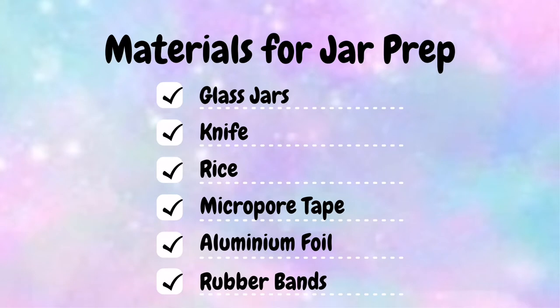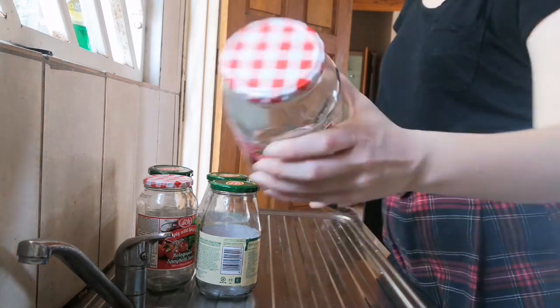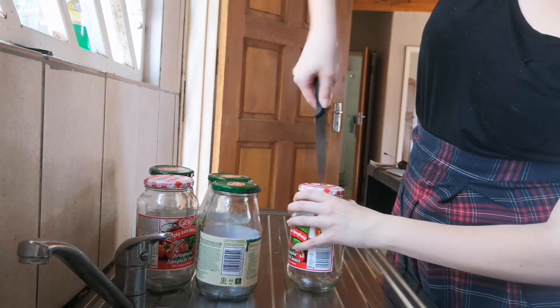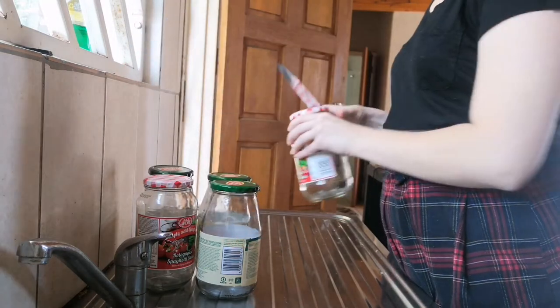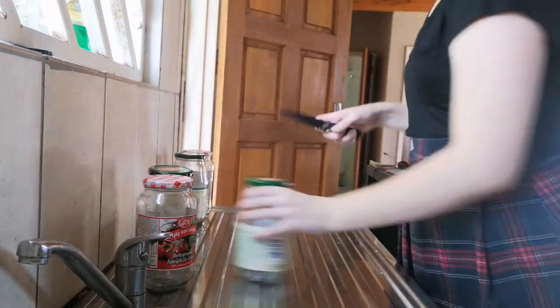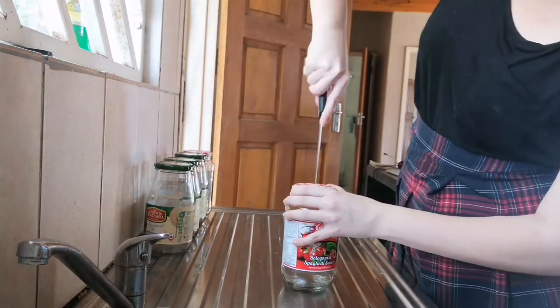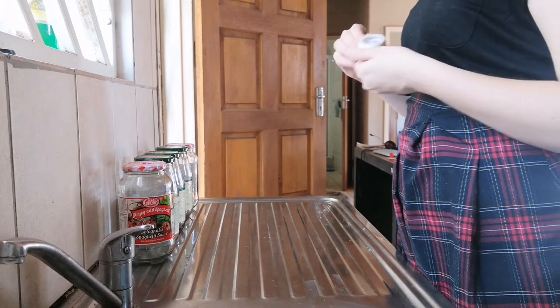For jar preparation, you're going to need glass jars, a knife, rice, micropore tape, aluminum foil, and rubber bands. First, get a knife and make holes in the top of your jar lids — you can use a screwdriver as well. Press it in, twist it, then bend the sides of the hole inwards so they don't get stuck on anything. Repeat this with all your jars. We cover this hole with micropore tape, which is used for gas exchange so that oxygen and carbon dioxide can move in and out without any bacteria or spores coming in.